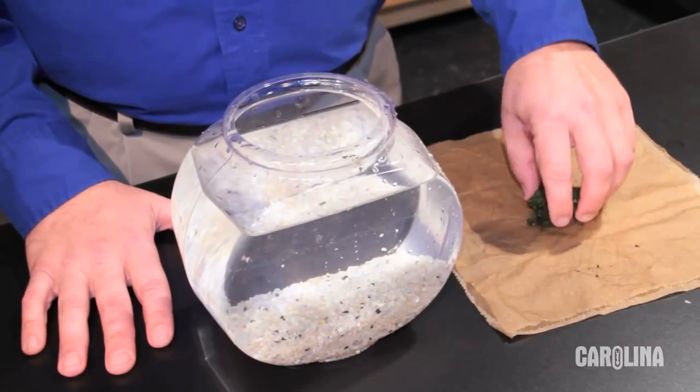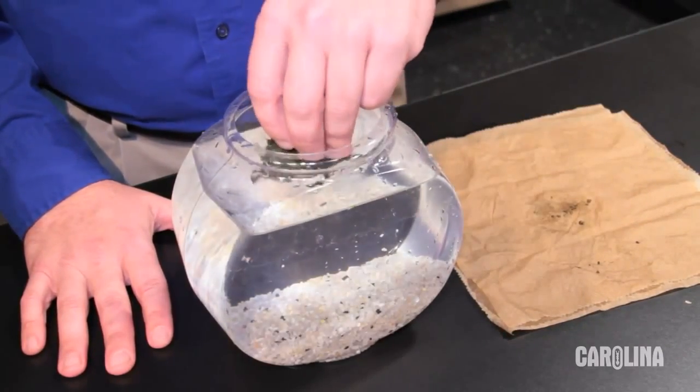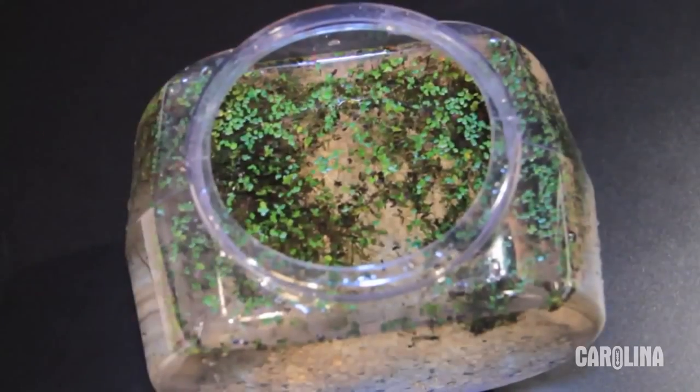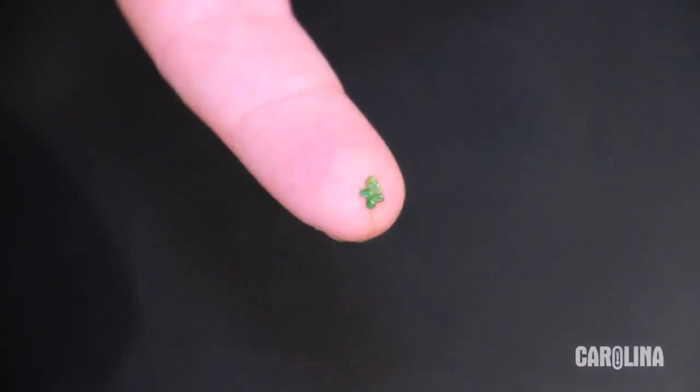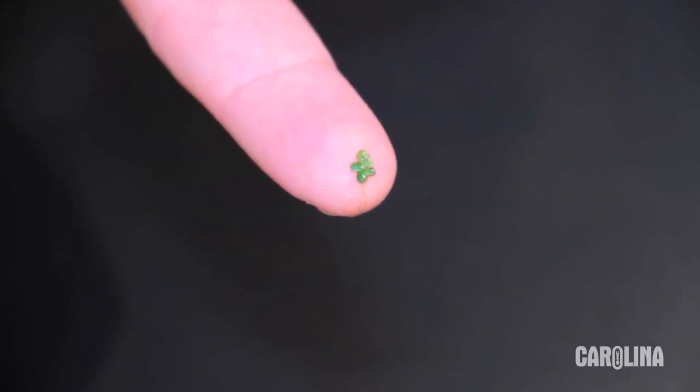Let's begin with Lemna minor, commonly called duckweed. It is shipped in a sealed plastic bag wrapped in a paper towel. Duckweed is a small floating plant — simply dump it in some water and spread it out. A tray works fine. Individual plants are tiny. Duckweed is used for population growth studies.